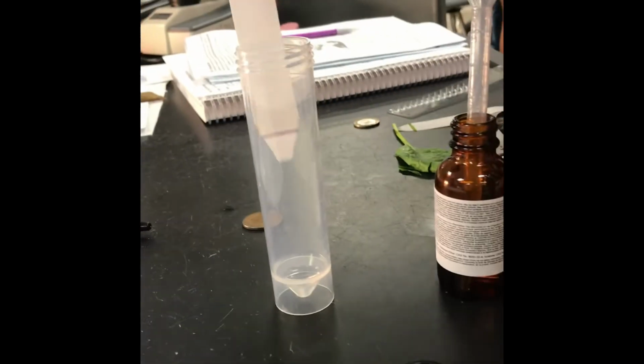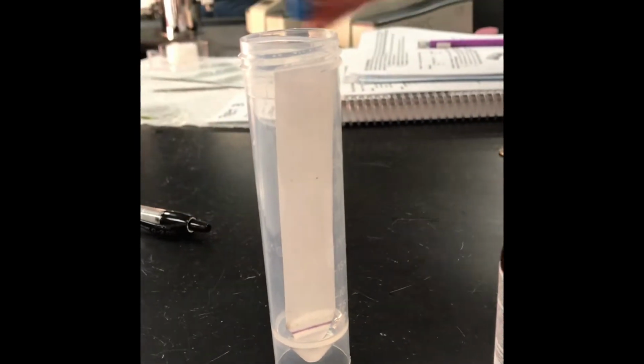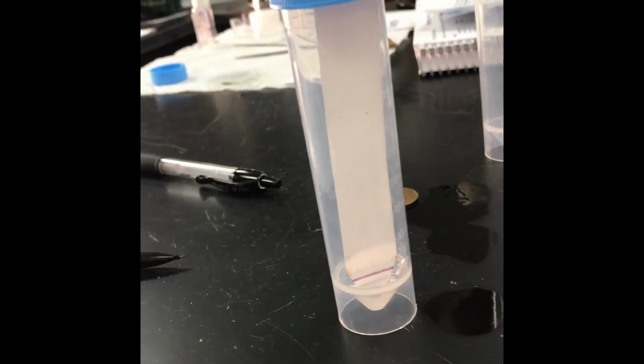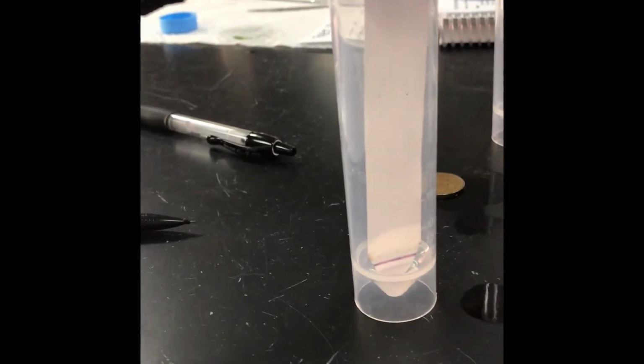So here you go, here's the first one. That's the fall leaf, beautiful. And so now they're gonna, ooh, look how good that is, y'all. You can actually already see the solvent line moving. You can see the solvent line is the clear, kind of like liquid moving up the paper. So they're gonna let this run for a while. It'll probably take about 15 minutes.